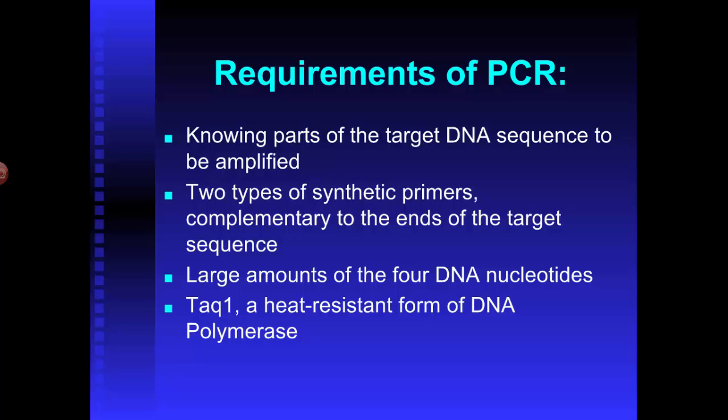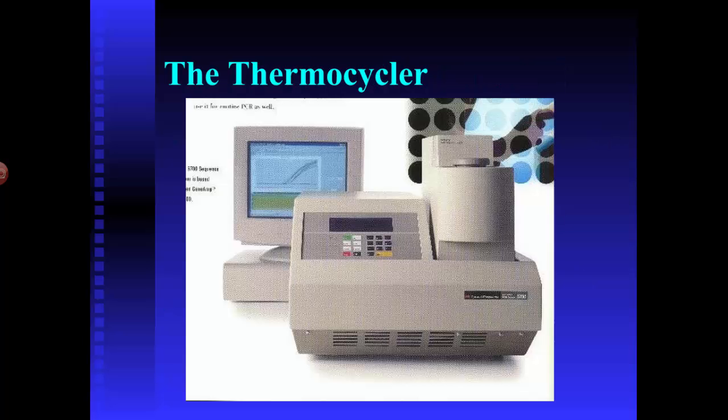And then when they have to heat up the PCR run, it's no big deal. DNA polymerase will still work at a high temperature. It's done at high temperatures for part of the run, and all of this happens inside an instrument called the thermocycler. A thermocycler is an automated computer-run instrument, and if you think of the word thermocycle, all it does is vary the temperature. It cycles through different temperatures, and different temperatures have different effects on DNA.